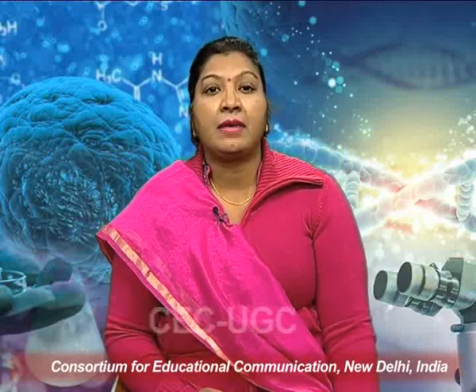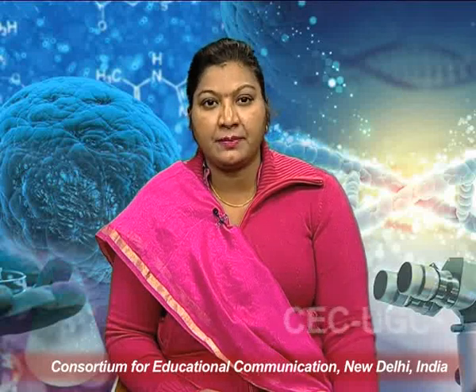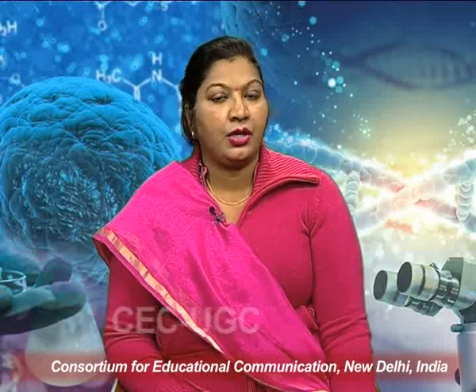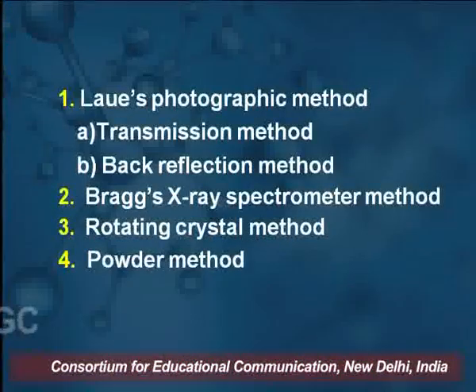Now, what are the methods of X-ray diffraction? There are 4 methods. Number 1 is the Laue photographic method. This is also divided into 2 parts, the transmission method and the back reflection method. Both come under the Laue method. Second is the Bragg's X-ray spectrometer method.